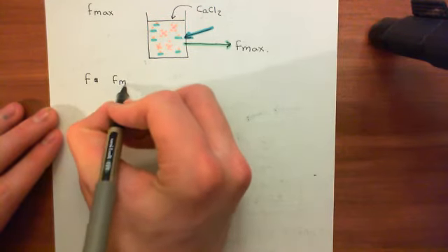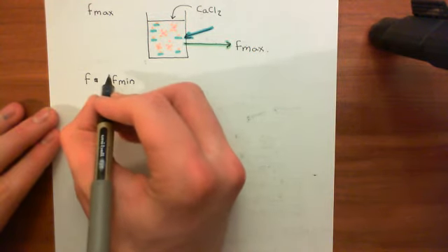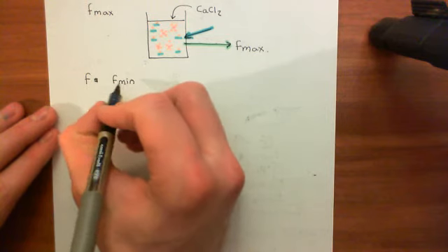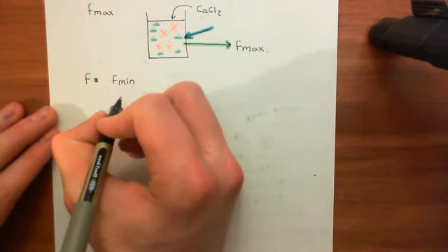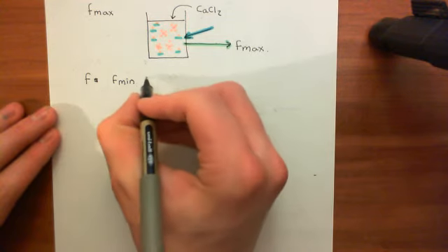Fmin, which was when we added the BAPTA to our test solution to bind to all of the free calcium molecules and result in no free calcium left in the solution, which means that there will be no calcium bound to the Fluo-4, which means that Fluo-4's fluorescent ability is at its lowest, and then the amount of green light that we get coming out at us is going to be at its minimum.